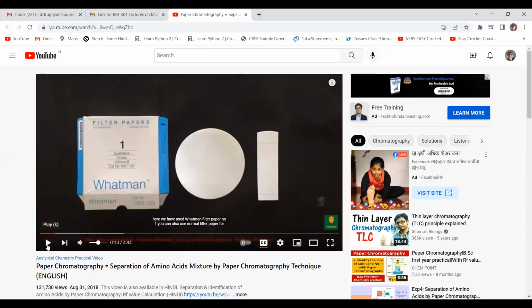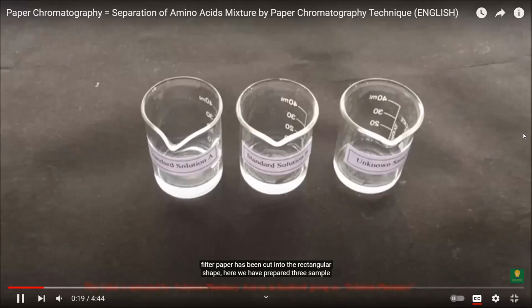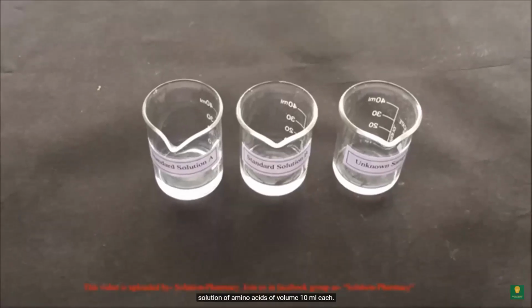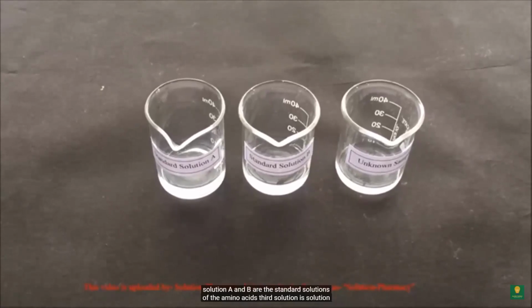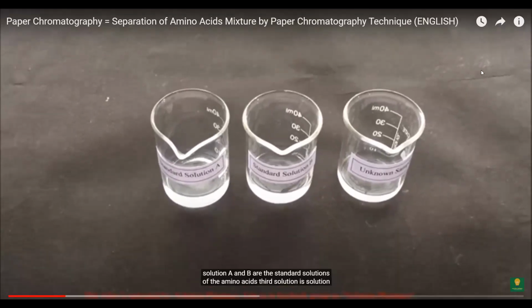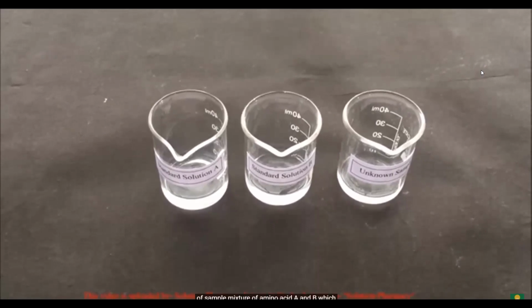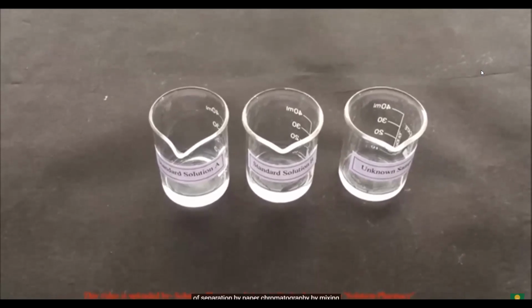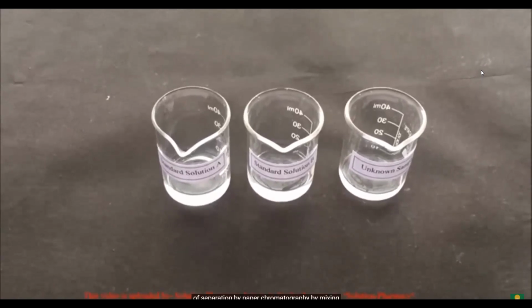Yes, ma'am. Yes, so use normal filter paper for this purpose. Cut the filter paper into a strip of rectangular shape. Here we have prepared 3 sample solutions of amino acid of volume 10 ml each. Solution A and solution B are the standard solutions of amino acids leucine and valine of concentration 1 mg per ml in distilled water. The third solution is the sample mixture of amino acids which we have prepared for the demonstration of separation by paper chromatography by mixing small volumes of solution A and solution B.